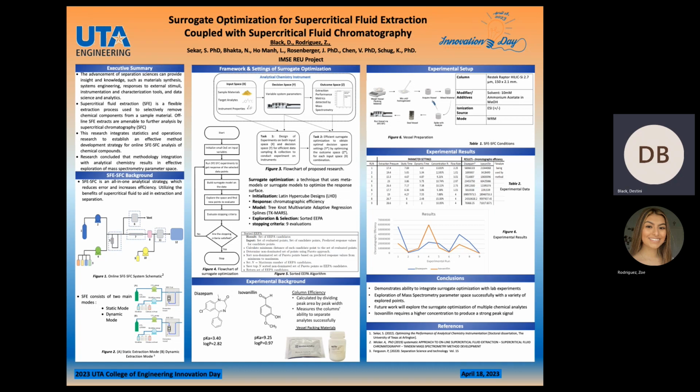The research integrates statistics and optimization research to establish an effective method strategy for the development of online SFE SFC analysis. The research concluded that methodology integration with analytical chemistry results in an effective exploration of mass spectrometry parameter space. The SFE SFC background shows that it is an all-in-one analytical strategy which reduces error and increases efficiency, utilizing the benefit of supercritical fluid to aid in extraction and separation.